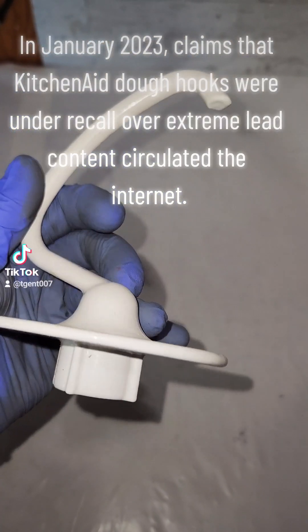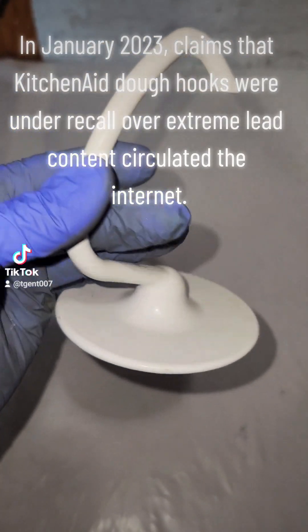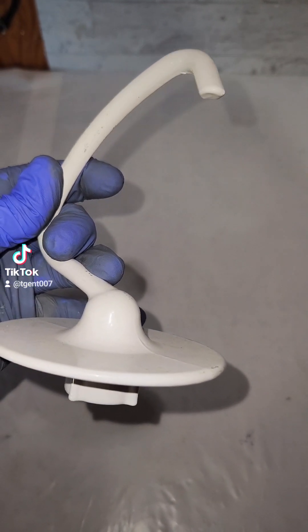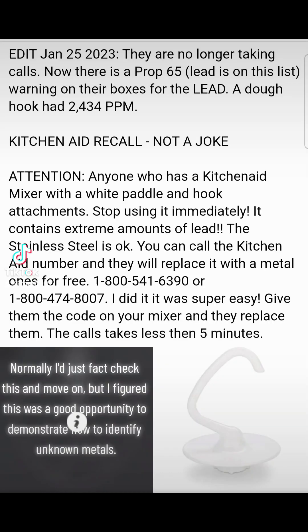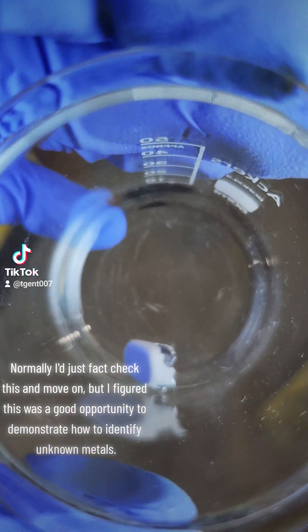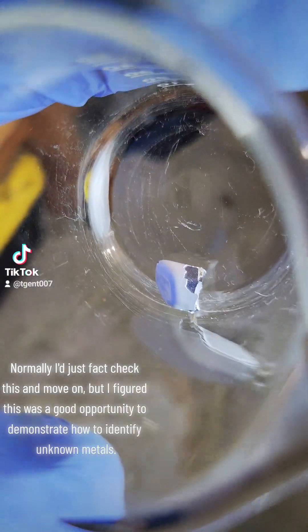In January 2023, claims that KitchenAid dough hooks were under recall over extreme lead content circulated the internet. Normally I just fact check this and move on, but I figured this was a good opportunity to demonstrate how to identify unknown metals.